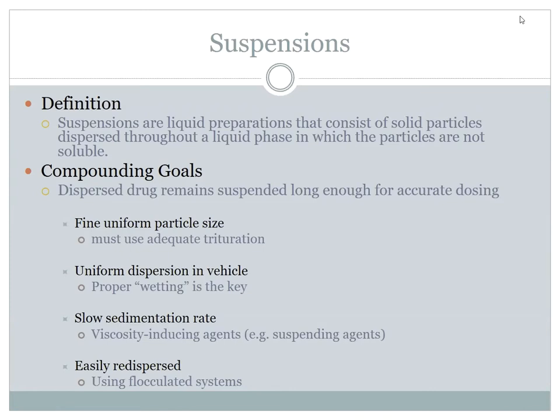Well, that's the point. Today, when you pour your liquid onto your drug powder, it will form a clump. And if you liquefy it too quickly, those clumps float around and you cannot stab them to death with your pestle. So how are you going to make sure you don't get the clumps to form to begin with? Wetting the powder means taking the thicker or more viscous liquid, in this case, the suspending agent that you'll be using, and adding it slowly in very small amounts, and then pushing that powder into the liquid. Because at that point, there's not enough liquid, you can just shove that powder and force it into the liquid.